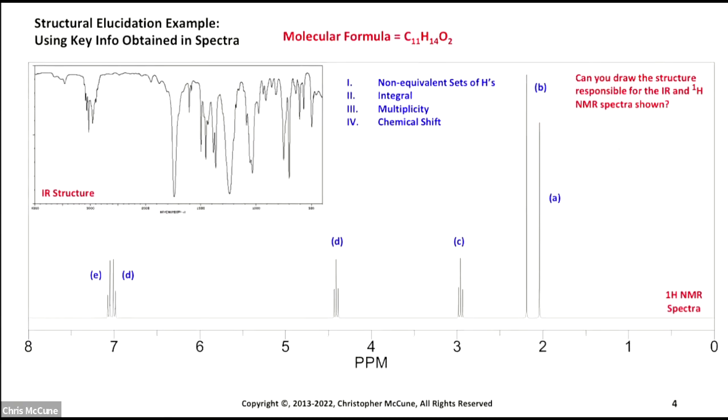So here is the IR for that compound, just to kind of help as well. And what you can see here in the IR, so this is where IR and NMR can kind of help each other out. You've got some CH stretches here that we see, and you have 2 different types.